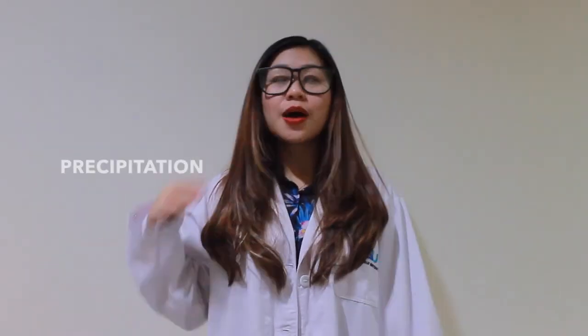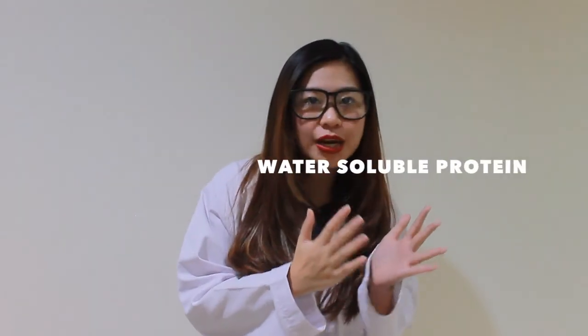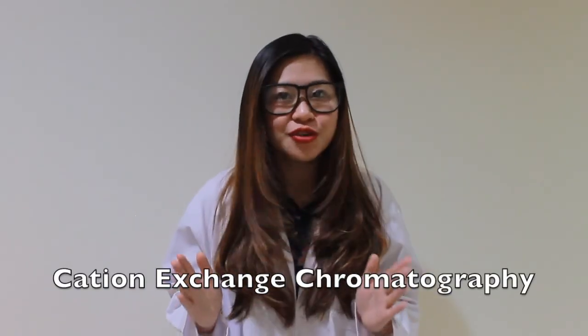So, the conclusion is, to isolate a protein, we can use many methods such as precipitation, chromatography, and etc. But in this case, we use precipitation to isolate the water-soluble protein from the lipoprotein. And then we use cation exchange chromatography to obtain the pure IgY from the water-soluble protein. And then, for checking the existence and the purity of the IgY, we can use electrophoresis methods.